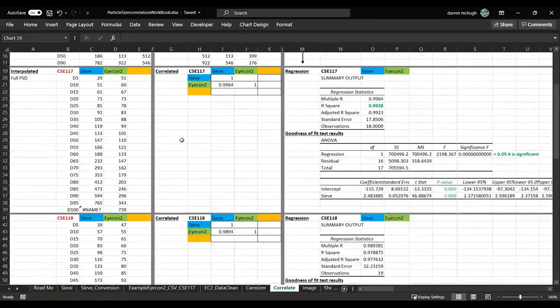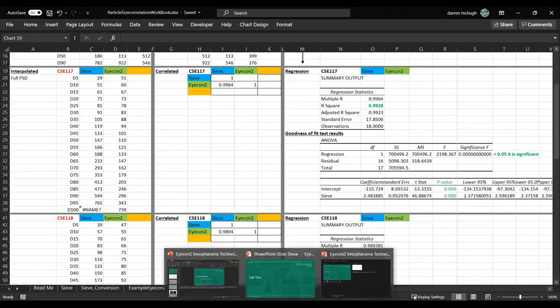Okay, so I hope that wasn't too boring or too fast for everybody. It was just really to show where you get your data from, how you can drop it in here, how you can do some simple analysis with it in Excel, and this can become your justification or part of your filing if you were looking for an alternative analytical method, if you wanted to bring in something like inline technology where you only have maybe an at-line technology currently. So let me jump back to some slides just to finish up, and we'll take some Q&A after that.